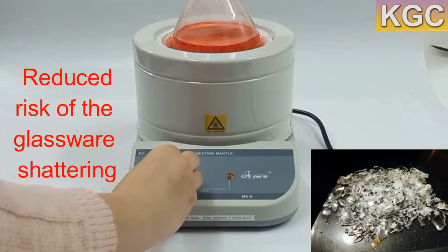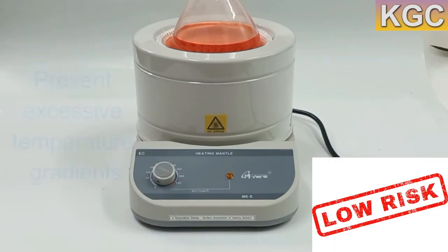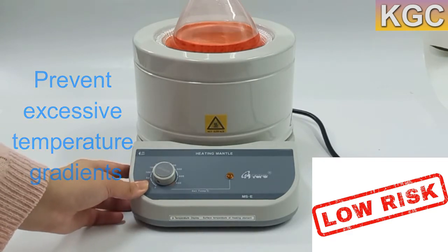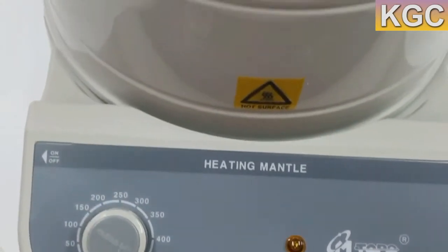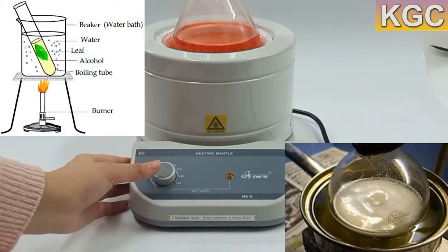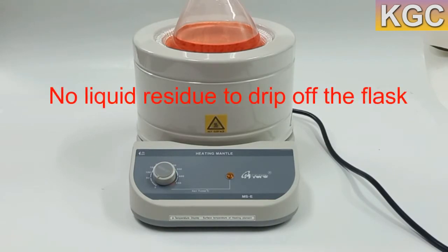Direct contact with the heating mantle does not substantially increase the risk of the glassware shattering, because the heating element is insulated from the container so as to prevent excessive temperature gradients. In further contrast to other methods of applying heat to a flask, such as an oil bath or water bath, using a heating mantle generates no liquid residue to drip off the flask.